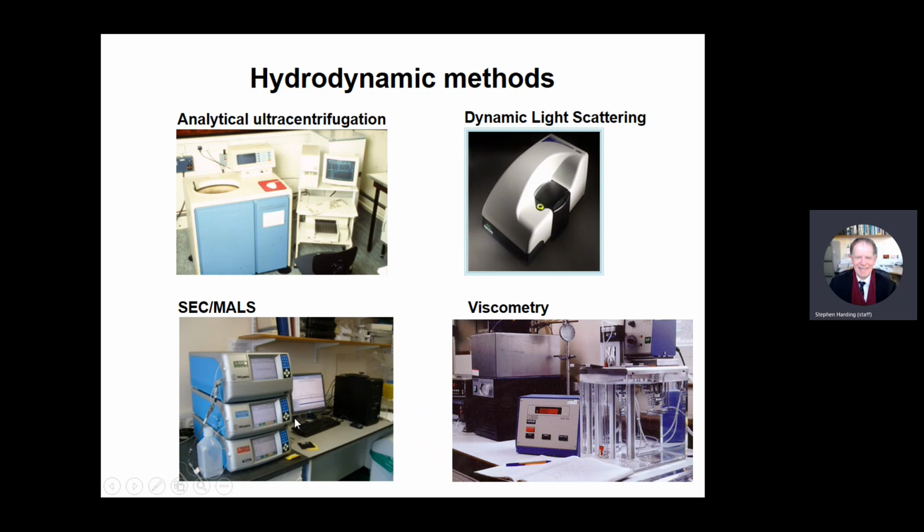We also measure the intrinsic viscosity with this device here, and then we measure the concentration. Obviously we have to correct for the time lag between the different instruments. Once that's done, we can get the intrinsic viscosity as a function of the molecular weight. So you get molecular weight distribution and intrinsic viscosity distribution. That's a very powerful combination when dealing with understanding the properties of linear types of polymeric molecules, which we've just been talking about in the previous lecture.